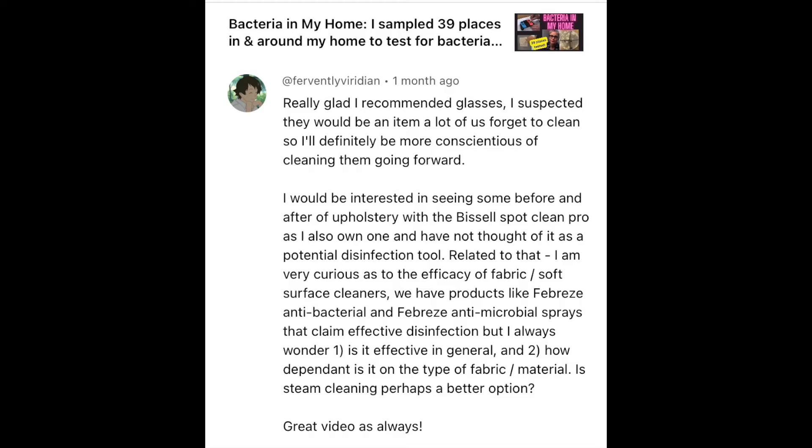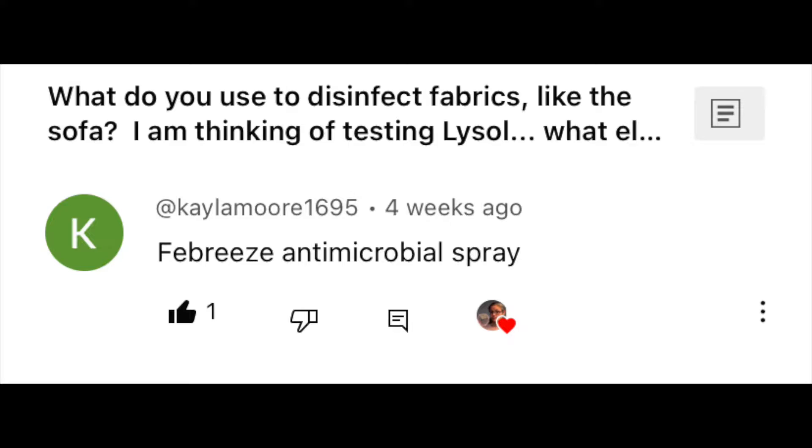This is also a viewer request video — Fervently Viridian suggested I try this in my bacteria throughout the home video, and Kayla Moore suggested it on a community post. Let's see how well the Febreze antimicrobial spray removes bacteria from my couch.